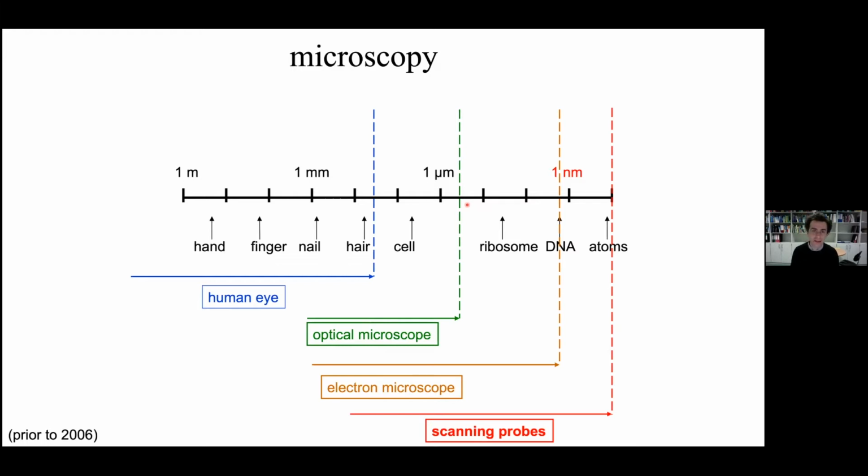One of them is electron microscopy, which is a bit over a century old as a method, which brings you down to the scale of 1 billionth of a meter, 1 nanometer, and also scanning probe methods, which also allow you to go down to atomic resolution. And this is where I want to start from, just to tell you what we are capable of, so where we can start off in terms of resolving things.